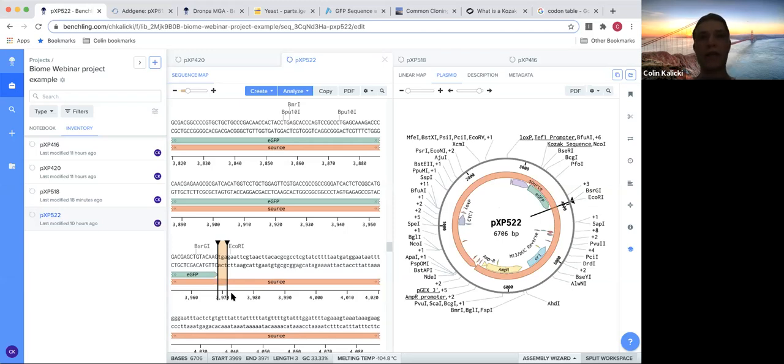All right, cool. Now we have one last thing. I'm forgetting one thing. I can't remember, but how are we going to stop transcribing? What do you need to stop transcribing? Yeah, you need the terminator sequence. Good. Cool. So let's do that.